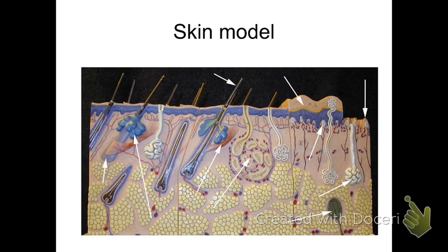Now, I keep saying the 3rd layer of skin. Every time you learn about skin, it will say epidermis, dermis, and hypodermis. But please, please, please know that the hypodermis is not a part of the skin. It's simply the layer on which skin sits.